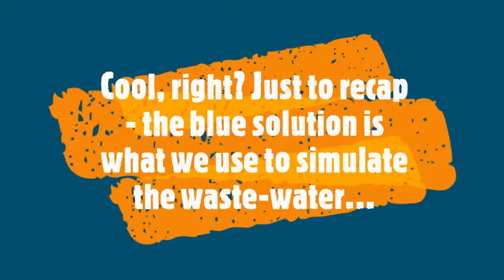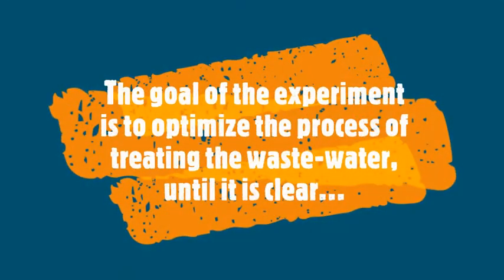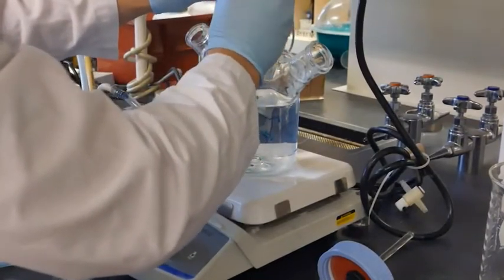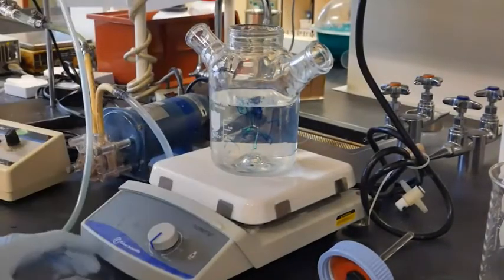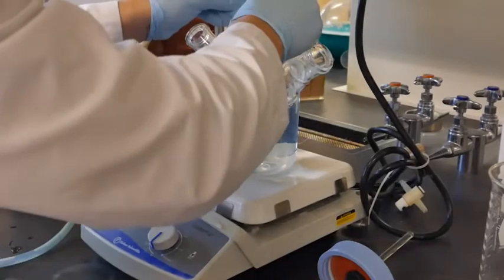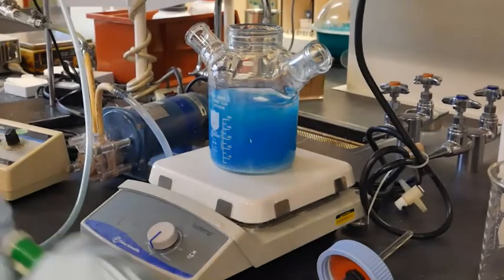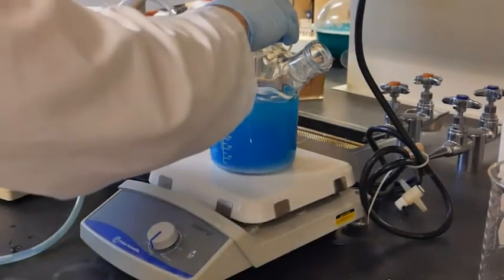Just to recap, the blue solution is what we use to simulate the wastewater. The goal of this experiment is to optimize the process of treating the wastewater until it is clear. Empty the system and prepare a solution of the measured water volume with 10 parts per million methylene blue and 1000 parts per million titanium dioxide. Also add roughly 5 milliliters of 6% hydrogen peroxide to kick-start the reaction.